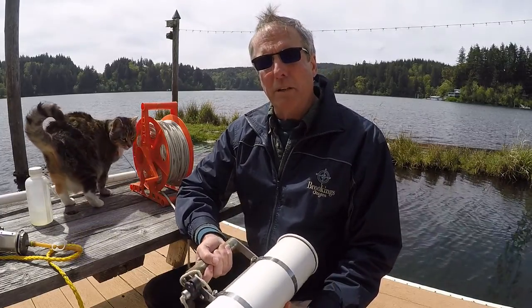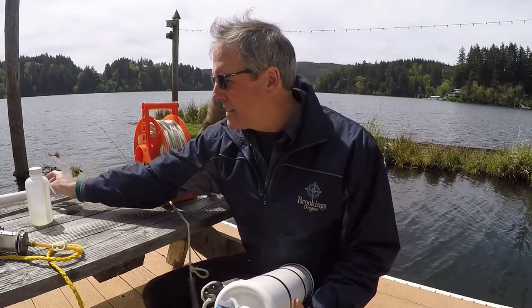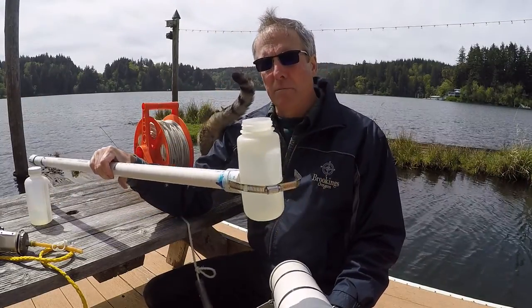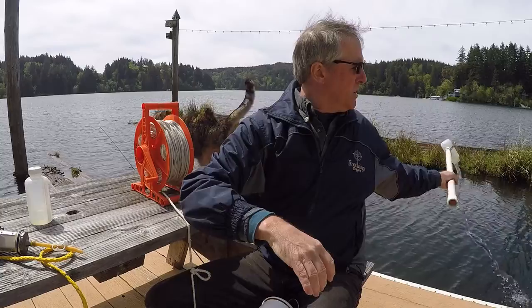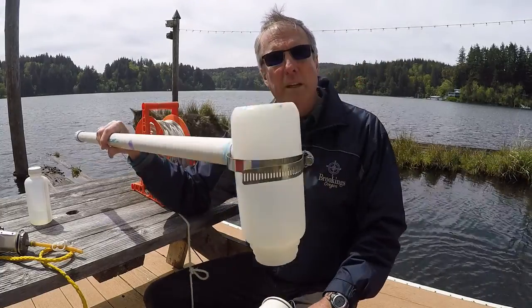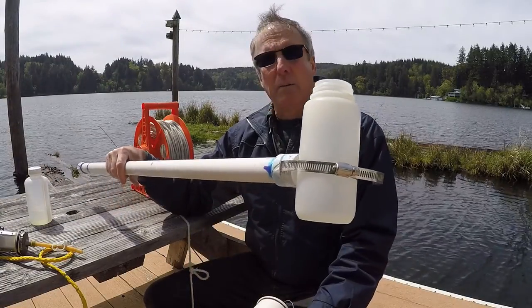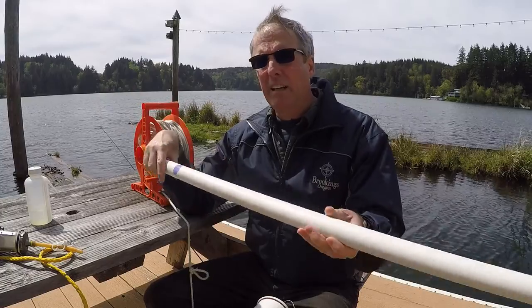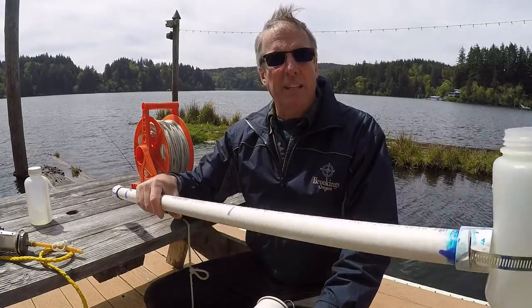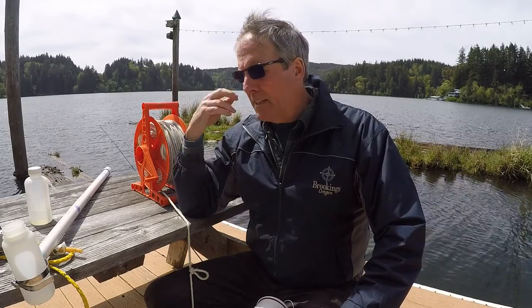When you're near the bottom though, it becomes a real problem, because if you just take a container, say we've looked before at our long arm sampler where we can go down in, and I explained how we were able to turn the bottle over when we lowered it into the water. That keeps the air in there, and we get down to whatever depth we're trying to get to, and then flip it over. So that works okay within maybe 10 feet. You can put an extension on here and probably get down to 5 to 10 feet at least, using that method. But if you're going to get a sample near the bottom of the lake out here, that's not going to work.